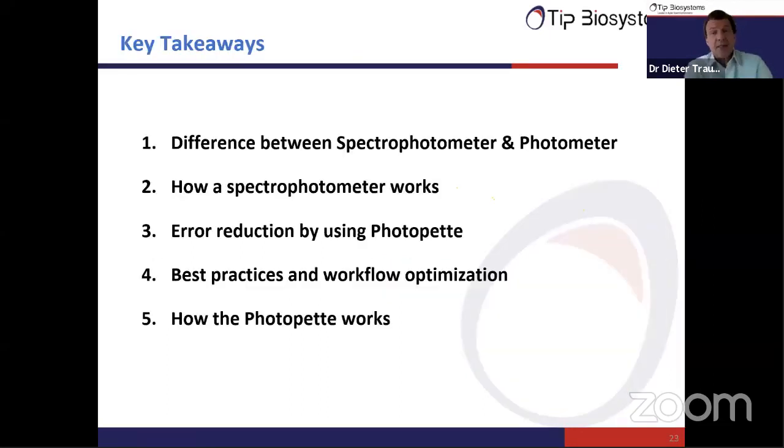So with this, let's recall a few of our key takeaways for this webinar. We touched on the differences between a spectrophotometer and a photometer. You have learned that a spectrophotometer measures light intensity or light changes of your sample at one particular wavelength of monochromatic light. The photometer technically is an instrument to measure all your surrounding light, the sun intensity. It's used, maybe, to calculate for a solar farm how much power it should make. Then you would need a photometer.